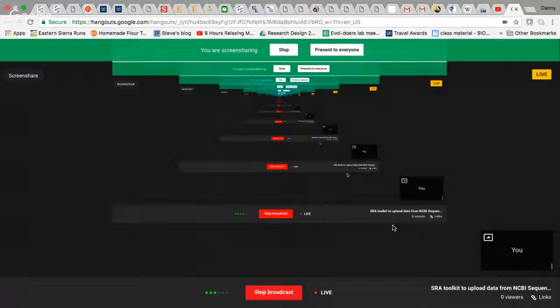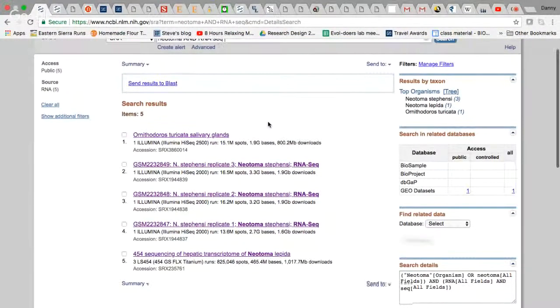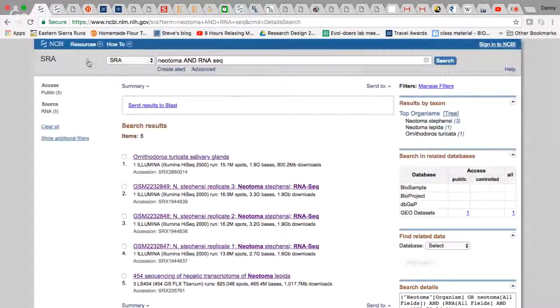So in this video, I wanted to work through how I found data on the Sequence Read Archive, and then how I used the SRA Toolkit, which is a toolkit that you can download to upload that data. So to start out, I'll just come here to the NCBI website.